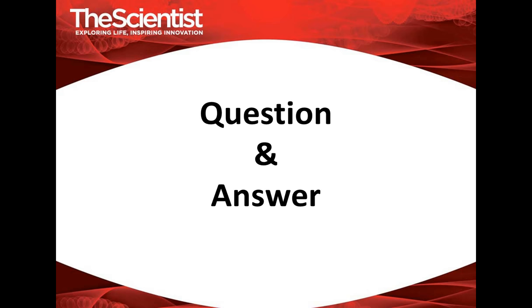So how small can you go is a good question, and I think MimEX is applicable to various sizes, and it depends on exactly the experiment you're looking at to perform. But even in 96-well, we do see some function retained. So I hope that partially at least answers the question.